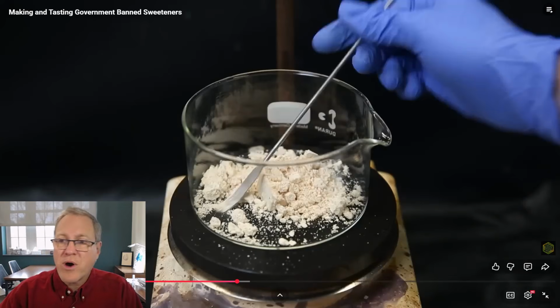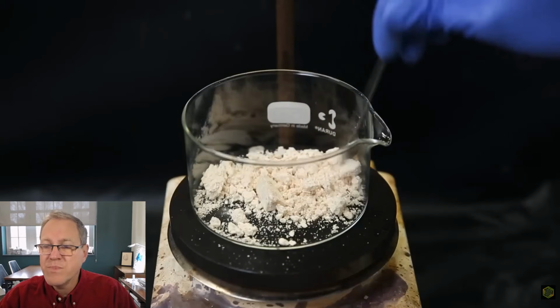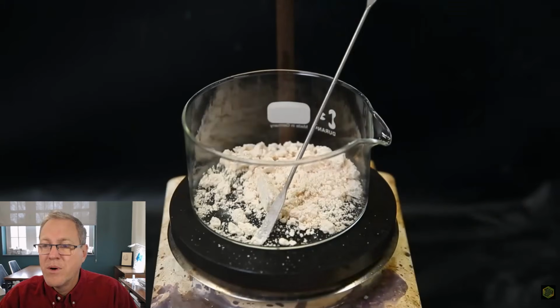But he just wants a product, so now he's going to recrystallize it. I did earlier, though this time, I first dissolve it all into boiling ethanol.